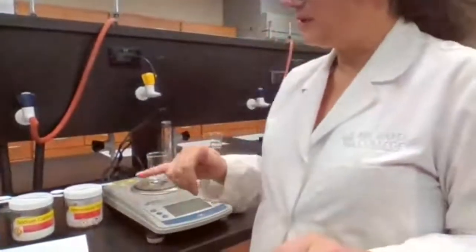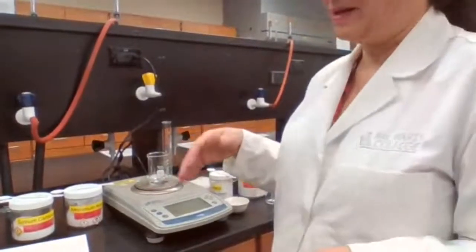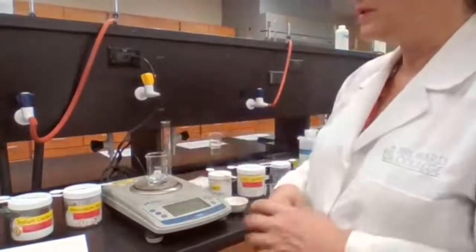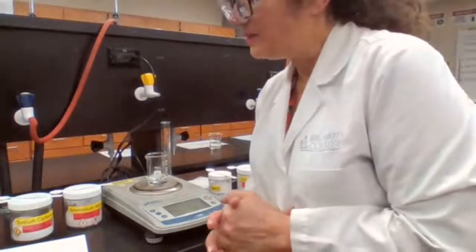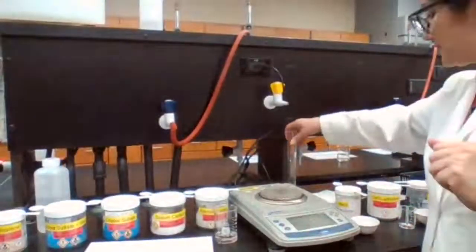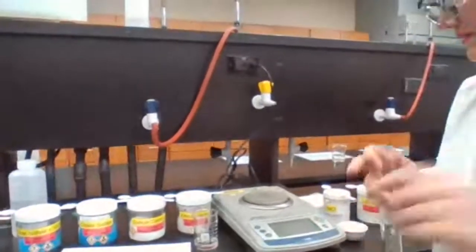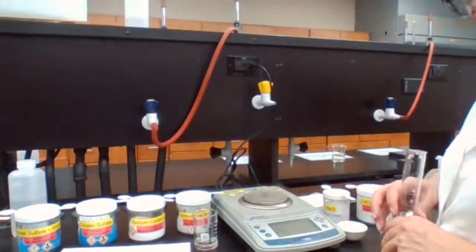There are two things. First of all, you want to make sure how to measure. If it's chemicals, it cannot be on the balance. Second, come up with a procedure that you can put exact amount of it. Next, measuring by difference. So we want to measure 50 milliliters of water in a graduate cylinder. What you do first, you're going to make sure the balance is 0. So we use the tare to make it 0.